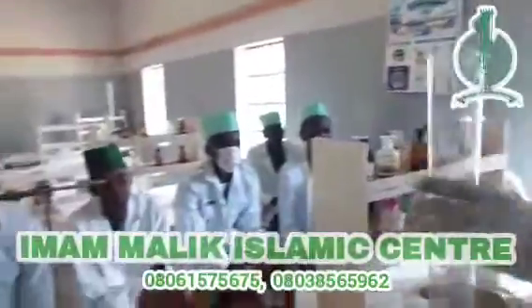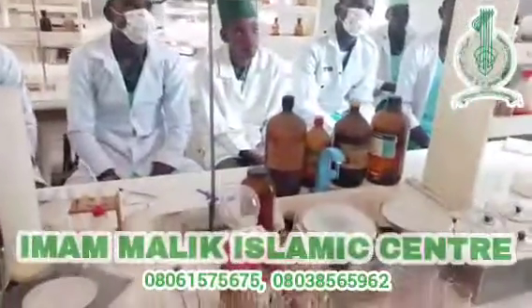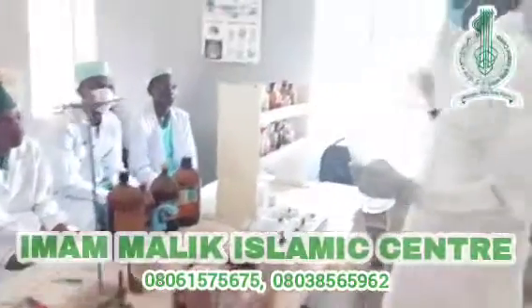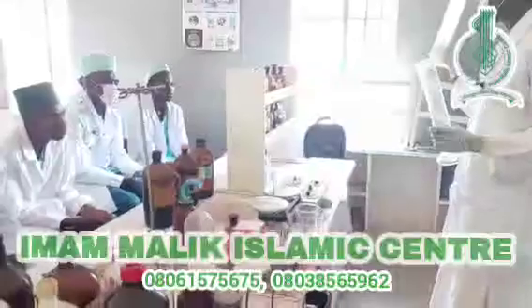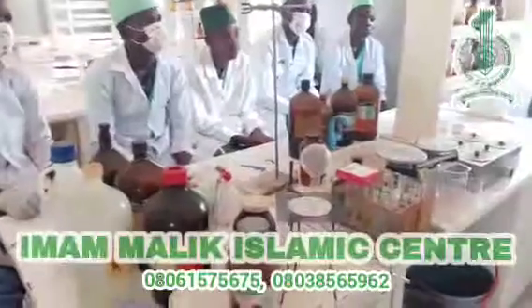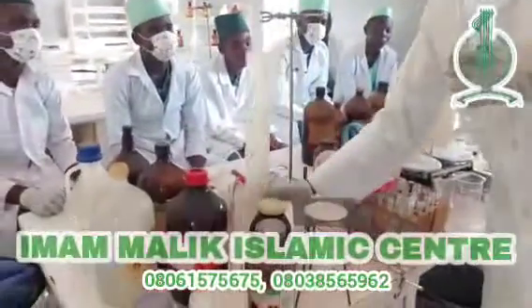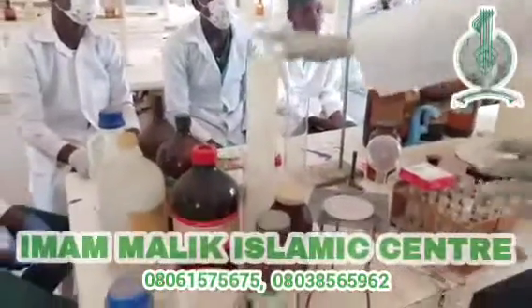As you can see, this is graduated 500 mL or 500 cm cube. It is made of glass. And this one is the rubber type, graduated 1000 cm cube or mL. That is 1 dm cube. So this is half of this. The difference is the material and the size, the volume. This one is 1 dm cube, meaning 1000 cm cube, and this is half of it. And the material is glass and this is rubber.